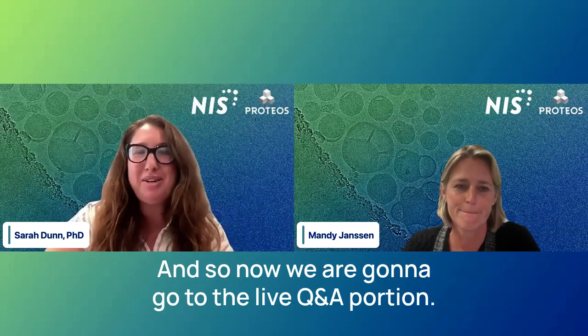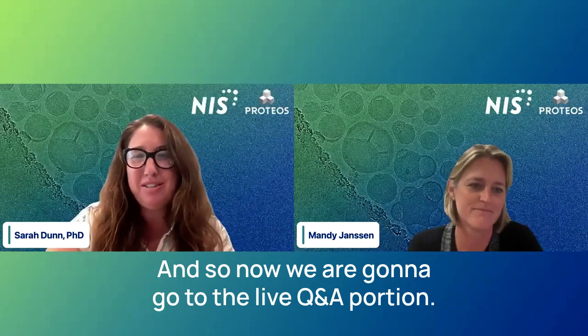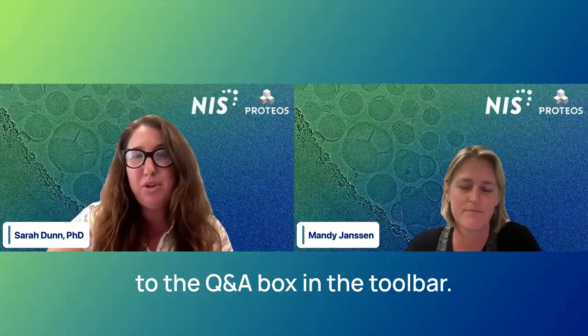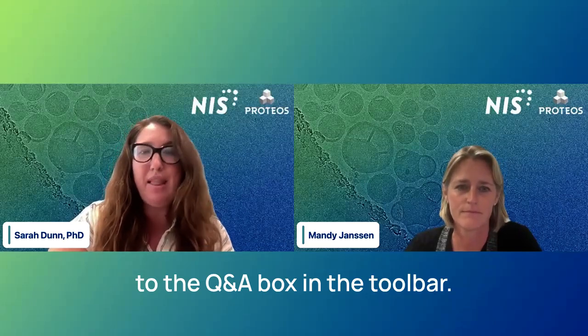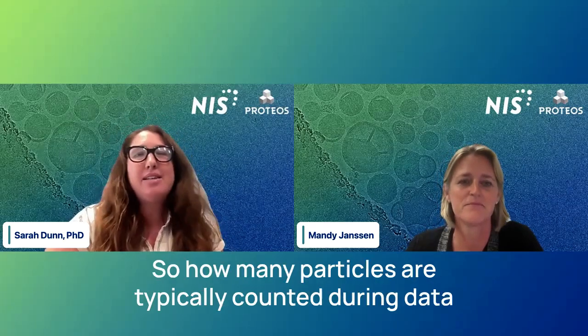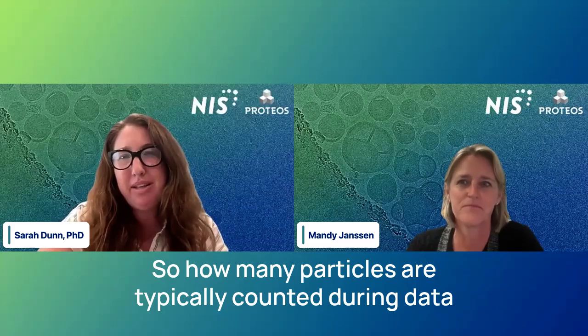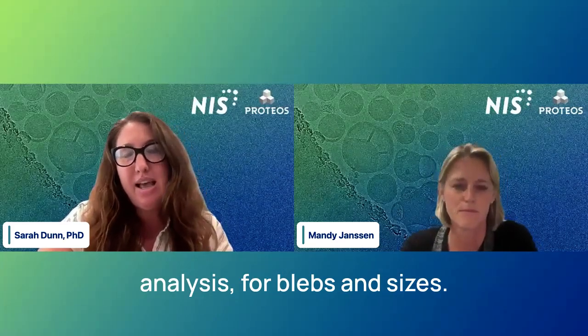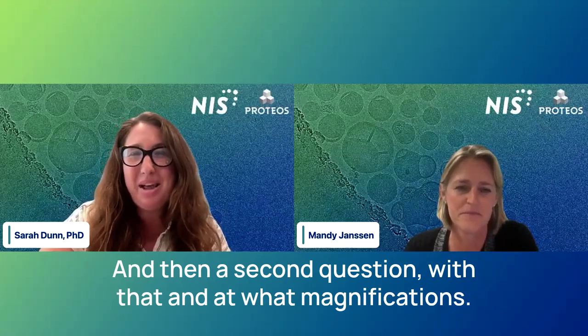And so now we are going to go to the live Q&A portion. If you have a question, just as a reminder, you can submit them to the Q&A box in the toolbar. And our first question, Mandy, is about the number of particles that we include. So how many particles are typically counted during data analysis for blebs and sizes? And then a second question with that, and at what magnifications?